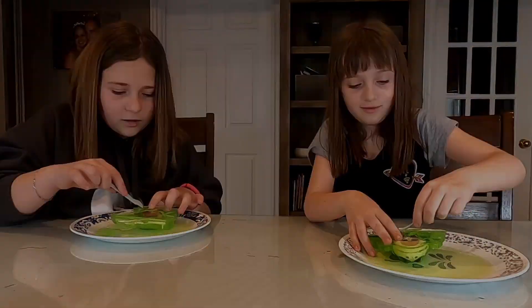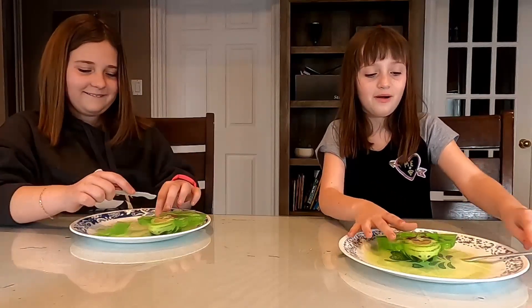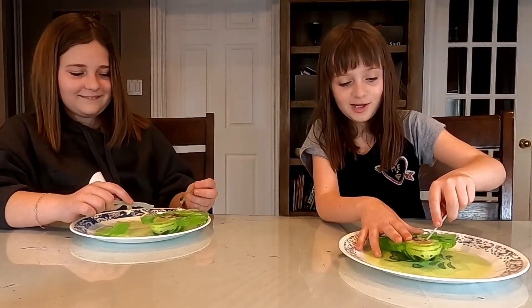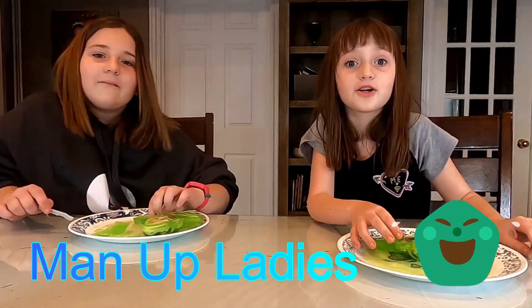Ew, it's hard. This is so cool but slimy. You guys sound like such girls right now. We are girls!